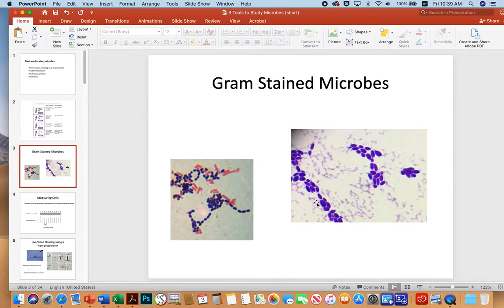Over here is just a gram stain done on a population of Saccharomyces yeast. So again, they stain gram-positive technically because they take in the first dye, crystal violet, and largely resist decolorization based on their cell chemistry. So they're not technically gram-positive in the sense of like you would call a gram-positive bacterium gram-positive. These guys are just going to take the first dye and hold on to it no matter what.